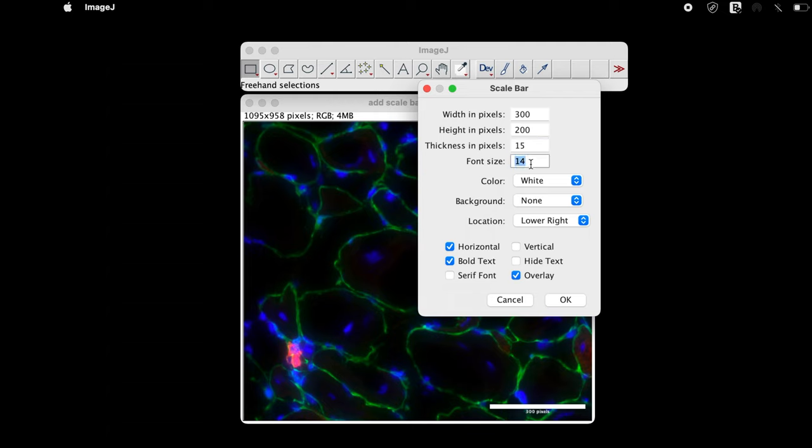Let us change the size to 30. At the lower right of the image, the size of the text has been increased.